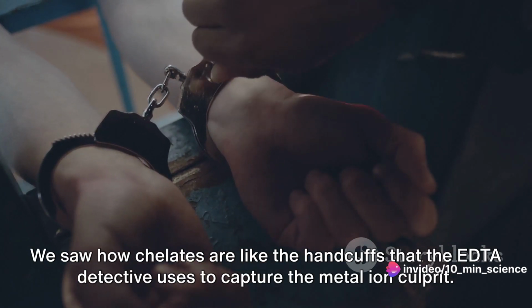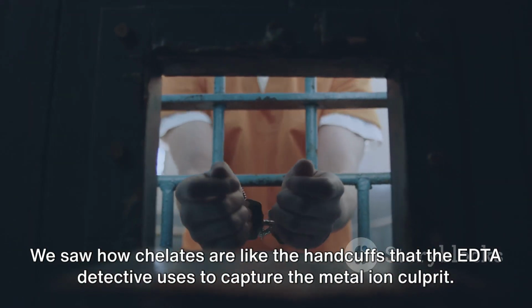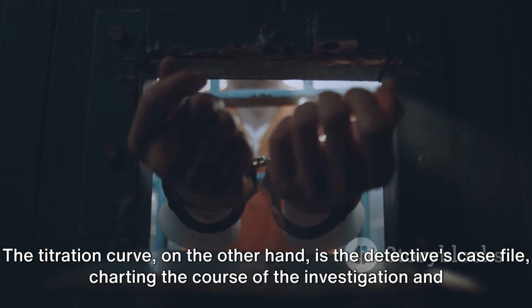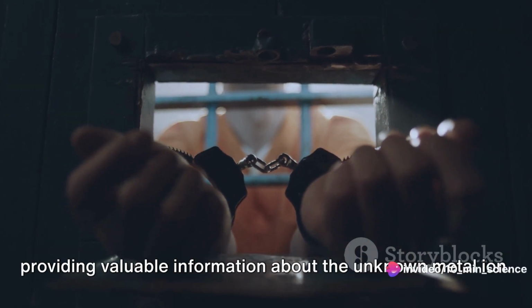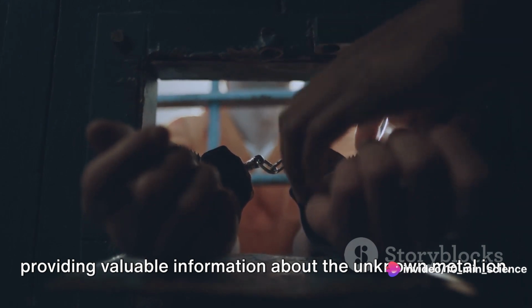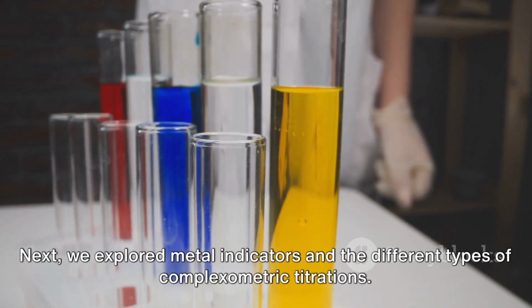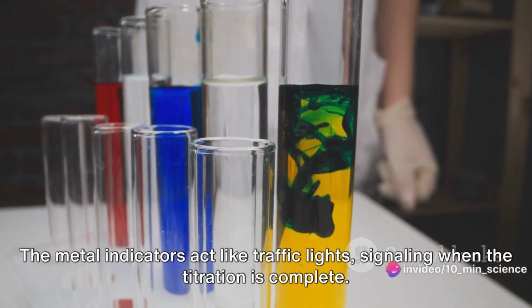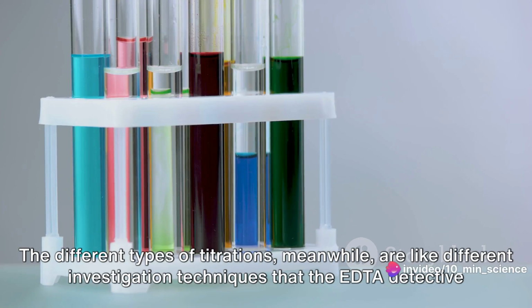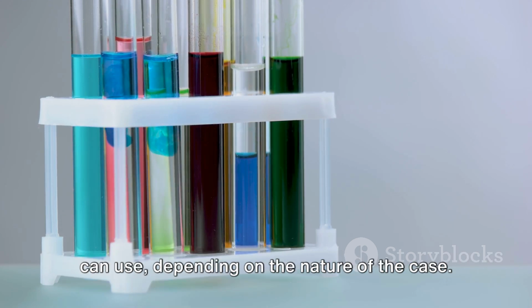We saw how chelates are like the handcuffs that the EDTA detective uses to capture the metal ion culprit. The titration curve, on the other hand, is the detective's case file, charting the course of the investigation and providing valuable information about the unknown metal ion. Next, we explored metal indicators and the different types of complexometric titrations. The metal indicators act like traffic lights, signaling when the titration is complete. The different types of titrations, meanwhile, are like different investigation techniques that the EDTA detective can use, depending on the nature of the case.